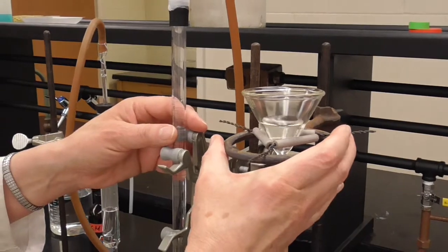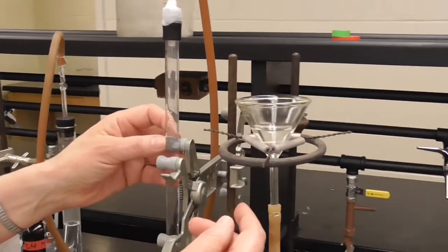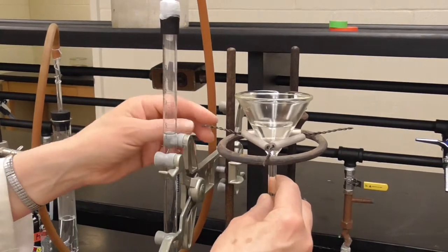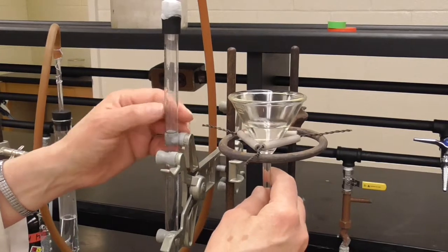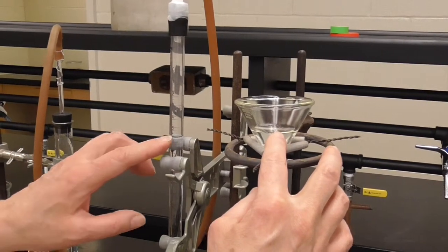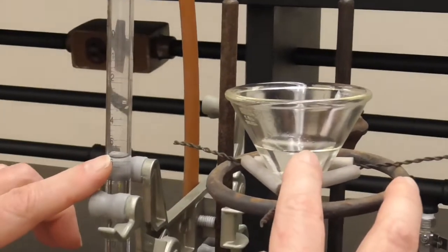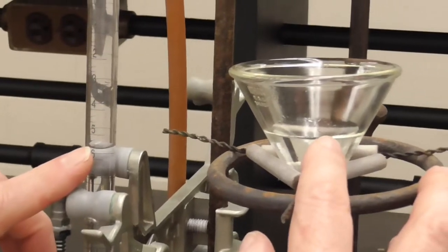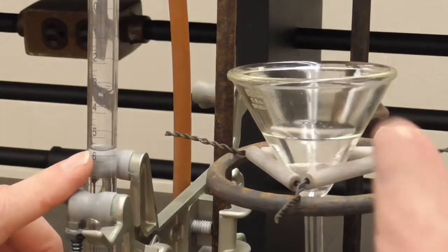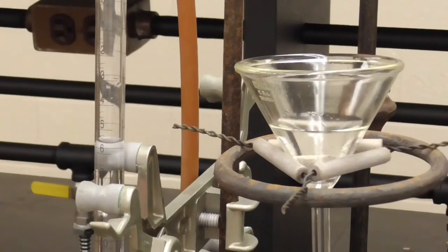This whole apparatus was previously filled with water, and you saw earlier that we measured the temperature of that water. The purpose of this apparatus is to function as a type of manometer, and this funnel is going to function as a leveling bulb. When the water level in the funnel and in the burette are equal to each other, which I don't think they are at this point, then we know that the pressure outside of this apparatus is the same as the pressure inside of the apparatus.